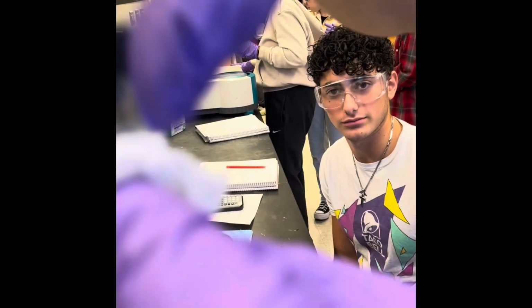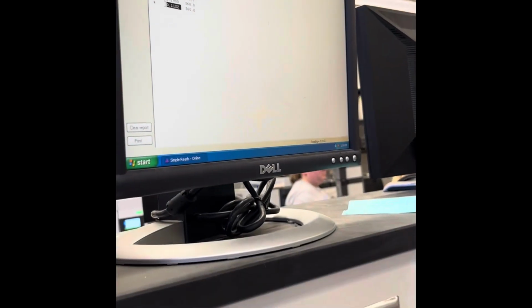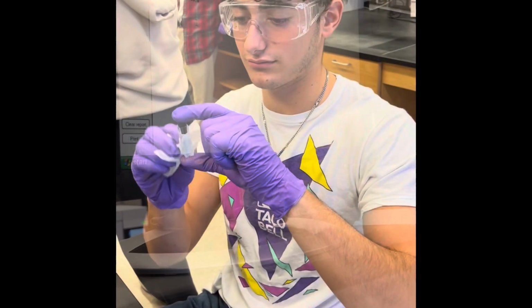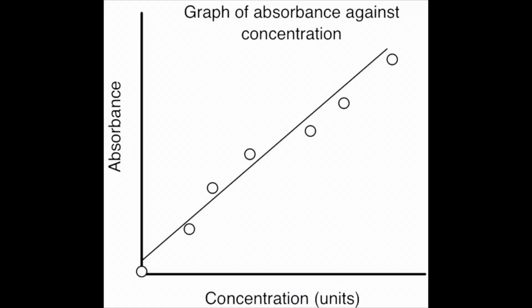The spectrophotometer will record all the absorbance values in the order in which you read them. The recorded absorbance values and calculated concentrations will allow you to determine the relationship between the absorbance and concentration and, in turn, calculate the concentration of the unknown solution. The absorbance of the solution can be determined through the relationship between concentration and molar absorptivity used in the Beer-Lambert law.